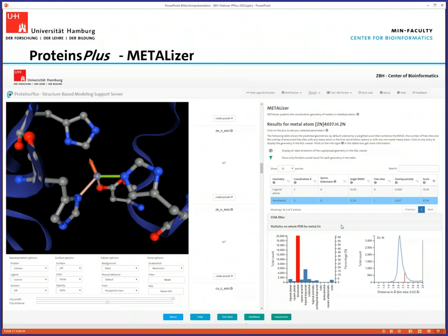We have some analysis tools which were important to us and we think are useful in the community. For example, we have a specific tool for analyzing metal ions in binding sites — if you have metal ions, you always have the question of how well they are represented in the structure and what the correct geometries are. What we do here is look at the local geometry, use this to calculate the most likely coordination geometry, and also give you statistics from the PDB about the most favorable coordination geometries for this specific metal ion.